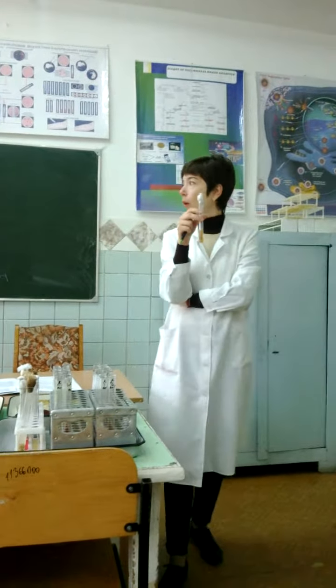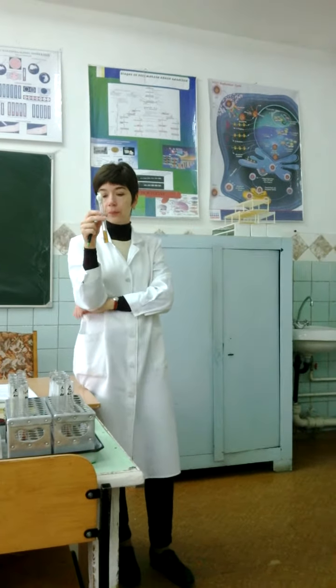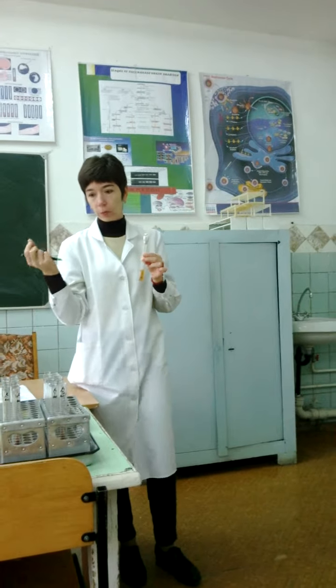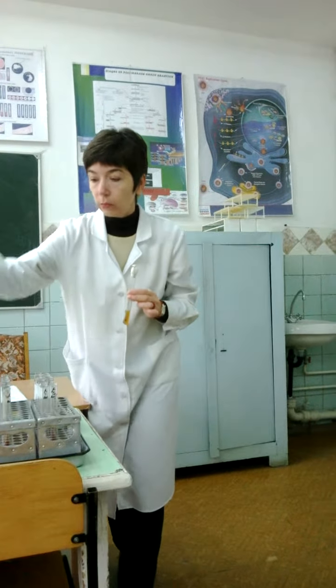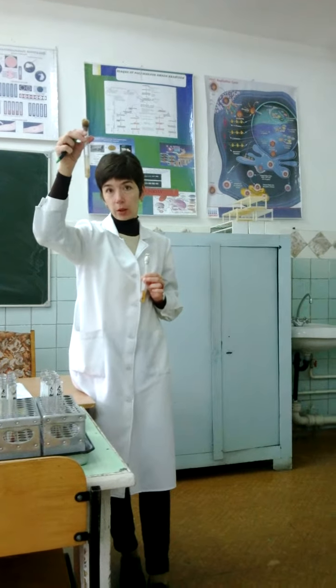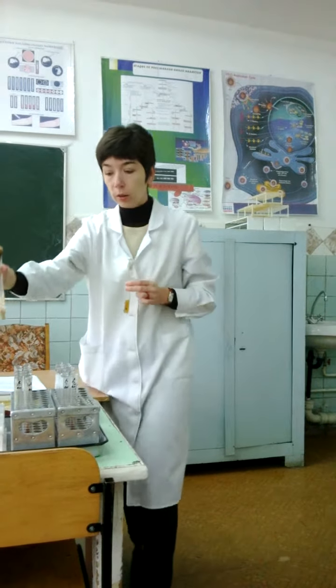The next media, also for anaerobic bacteria, is Wilson-Blair agar. It's a medium used for isolation of pure culture. It means we obtain separated colonies, because if we add bacteria in this, we don't know how many types of bacteria are present. We cannot isolate a pure culture without isolating separate colonies.